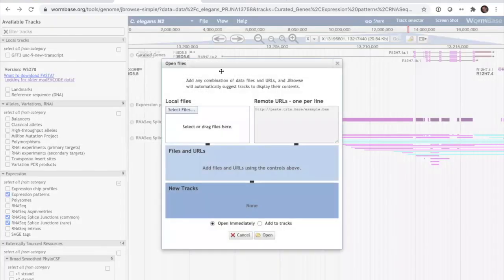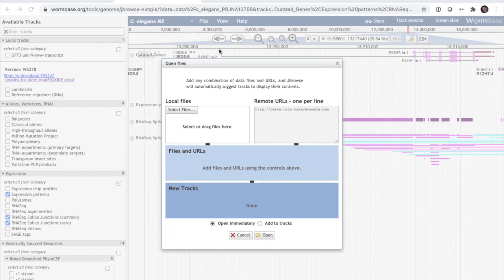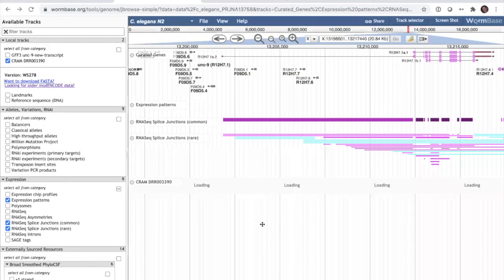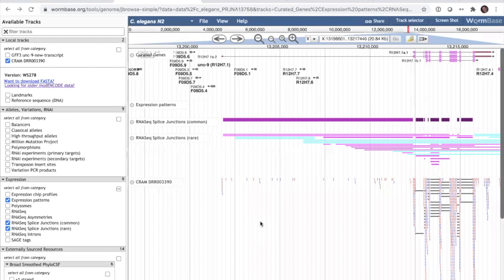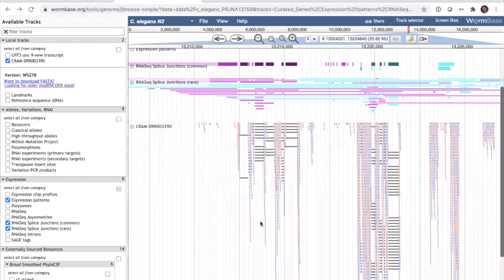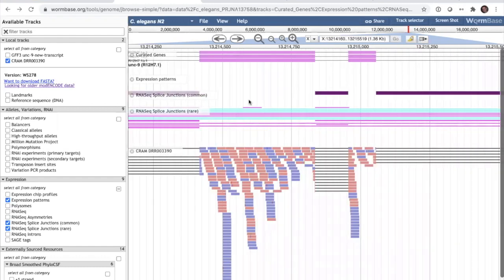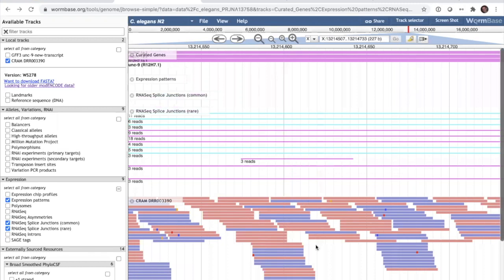For larger files, JBrowse supports BAM and CRAM files. I loaded CRAM data from WormBase colleagues at EBI. For CRAM and BAM, you must select both the main file and its index file. JBrowse automatically recognizes the file type and creates an alignment track. Even for large files this loads very fast. Zooming in enough reveals mismatches highlighted in the alignments.